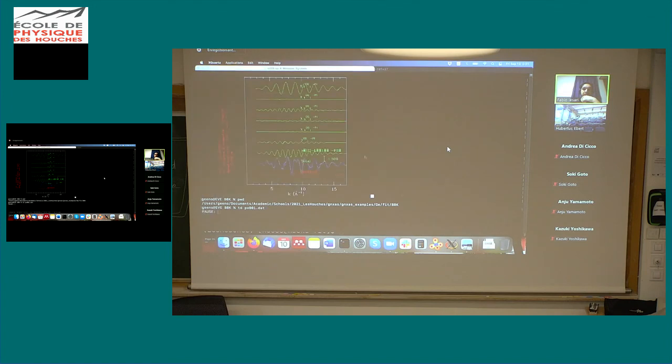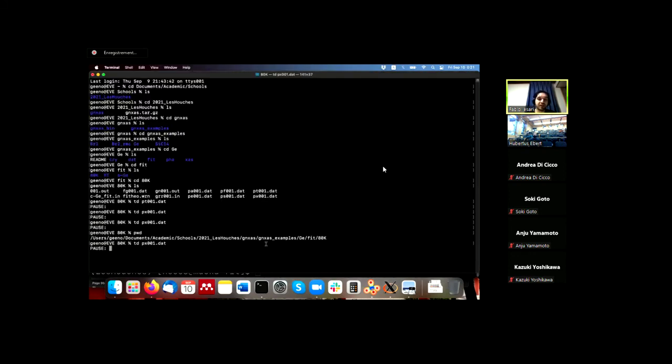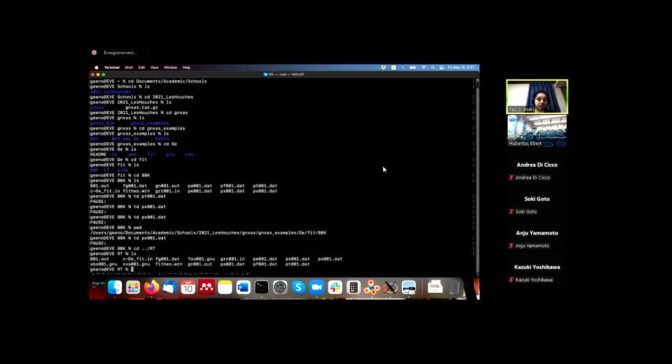What you see is that in this case we have many more multiple scattering signals that are required to fit the experimental data. Actually, if you look at the residual, there are still some additional oscillations, so maybe even more signals are required for a proper fitting. If we look at the room temperature one, this is already a better fitting, with the same number of multiple scattering signals.